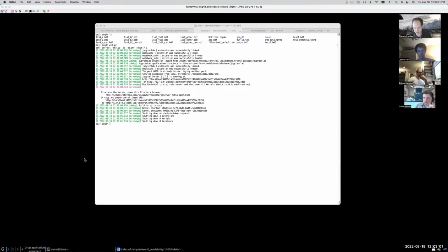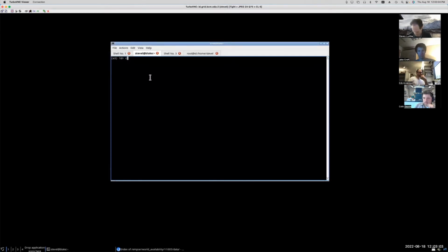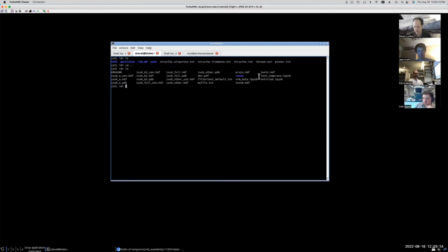That's all we needed there. So the data that I sent around, basically I took the, let me go back a folder, right? So I took the results of running that script that we put together, and I made this folder called Recon. And inside Recon, you'll find a particles folder, and that contains the results of the particles that we had generated in the folder up one level.